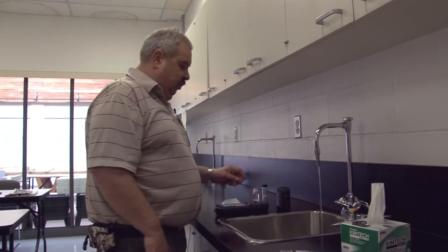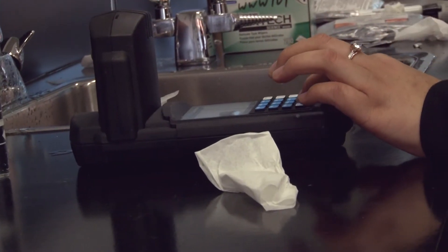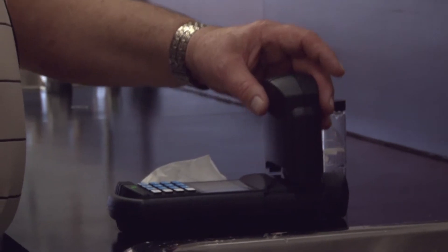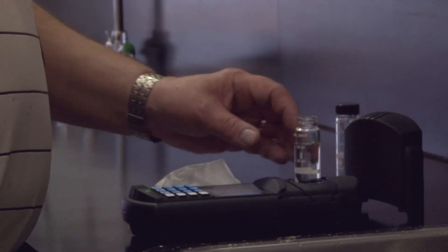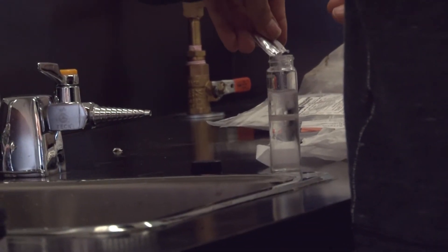Insert it with the diamond towards you and put the light shield on. By pressing zero, this will zero the machine. Then open one of your DPD powder pillows for free chlorine and deposit the chemical into the vial.